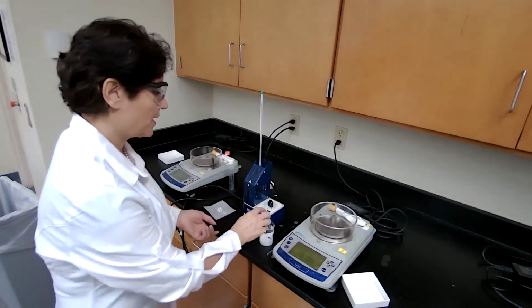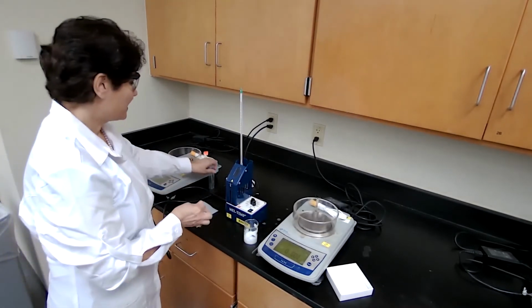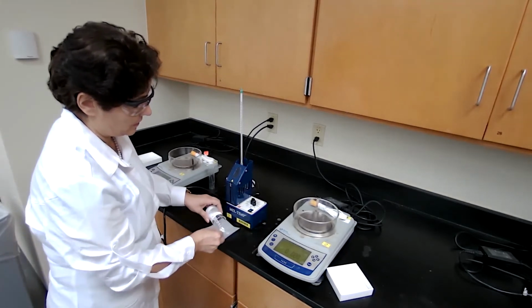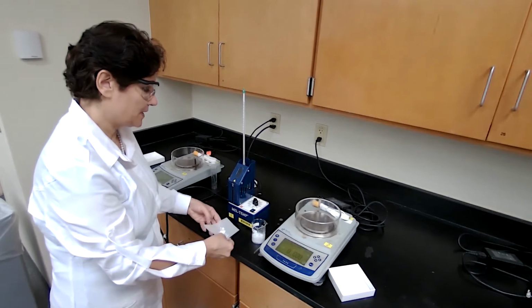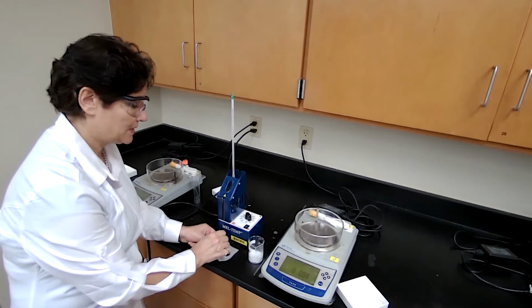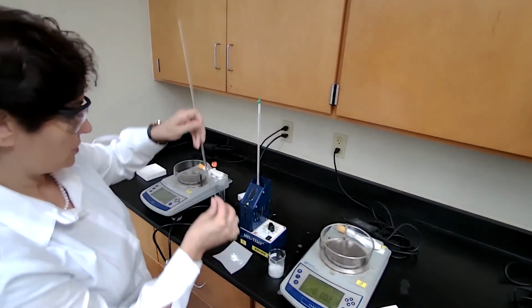The sample looks very dry, and we are going to measure the melting point, and that would be the moment of truth, because if the sample is not dry, it would melt very, very quickly. So I'm going to add some of that on the weighing paper, and because it's shiny, it's easy to crush the sample in here. We don't have to bring the mortar, and it's finely powdered. So very easy now, because it's dry, it easily goes into the capillary tube, and I will drop it through the hollow glass tube.